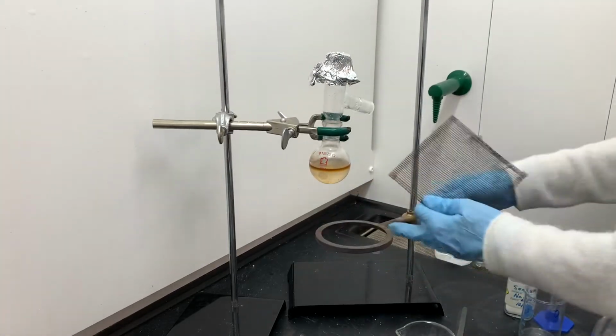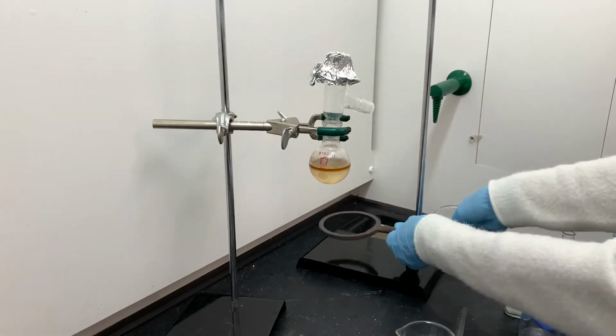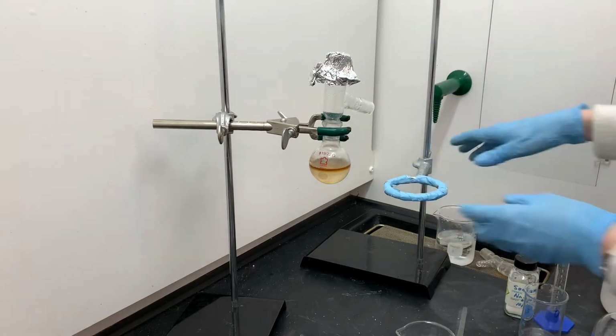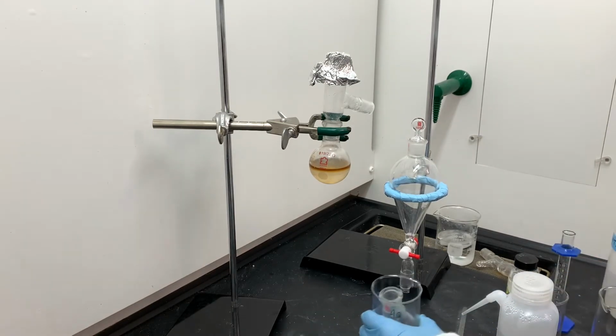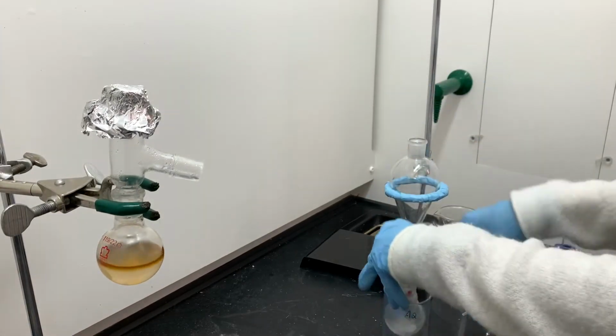Now, the byproduct of this reaction is water, so it's safe to assume that there's some water inside that receiving flask. It's also possible that some pinacol made its way into the receiving flask, maybe even some sulfuric acid. So the next thing that we're going to do here is purify the product using an extraction technique in a separatory funnel. This will be a pretty simple extraction in the separatory funnel. There's not a lot of steps involved in this particular extraction.